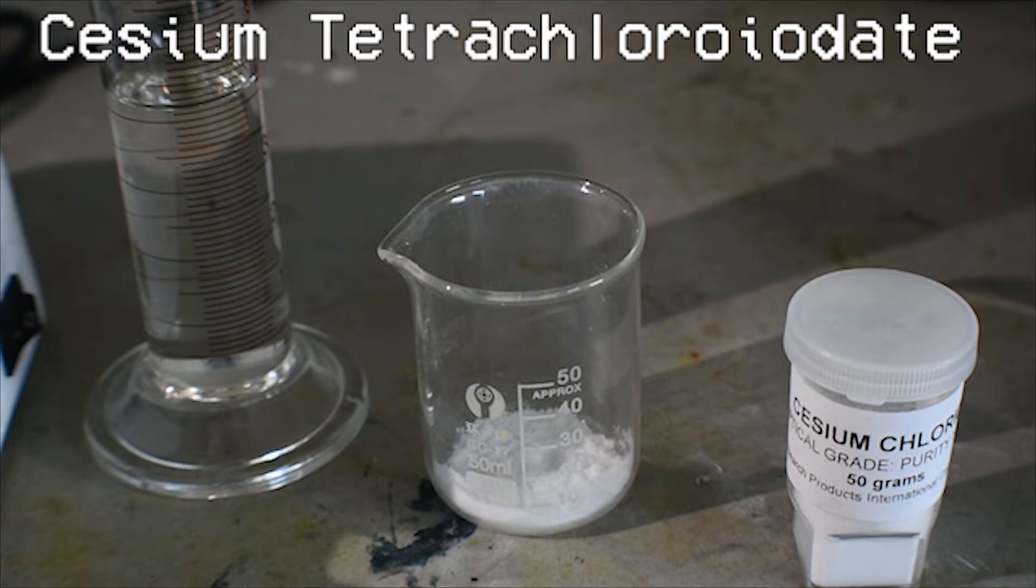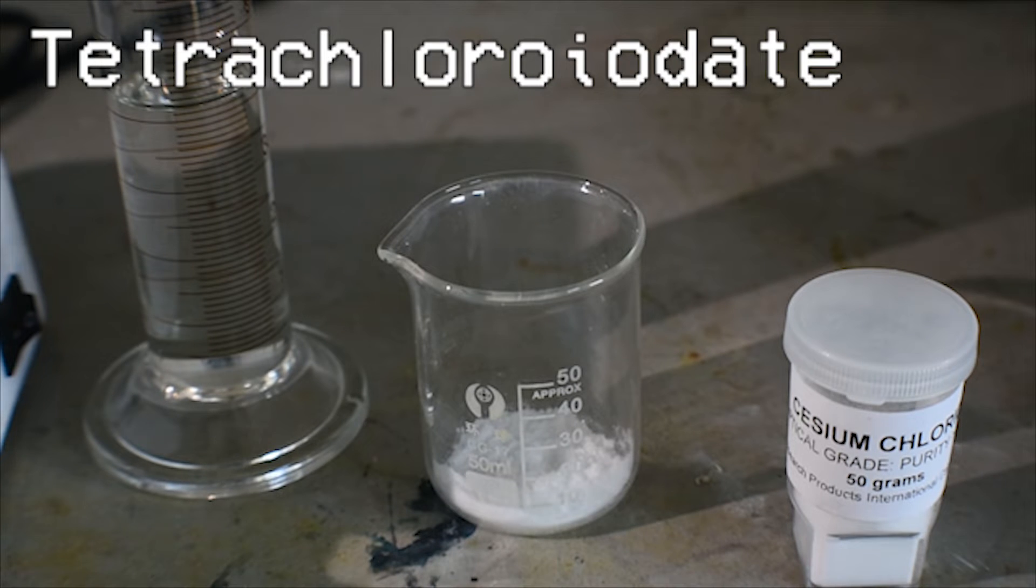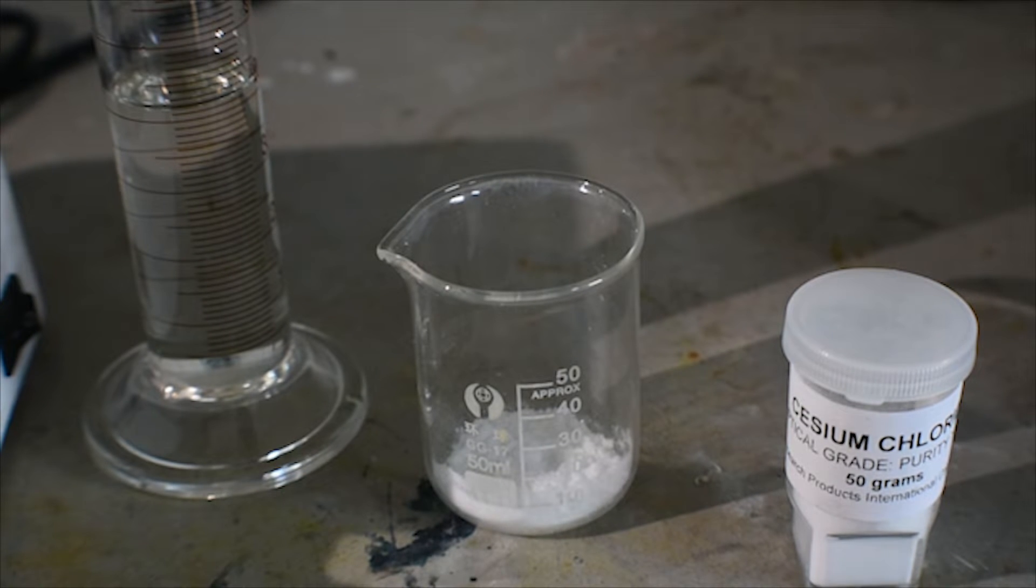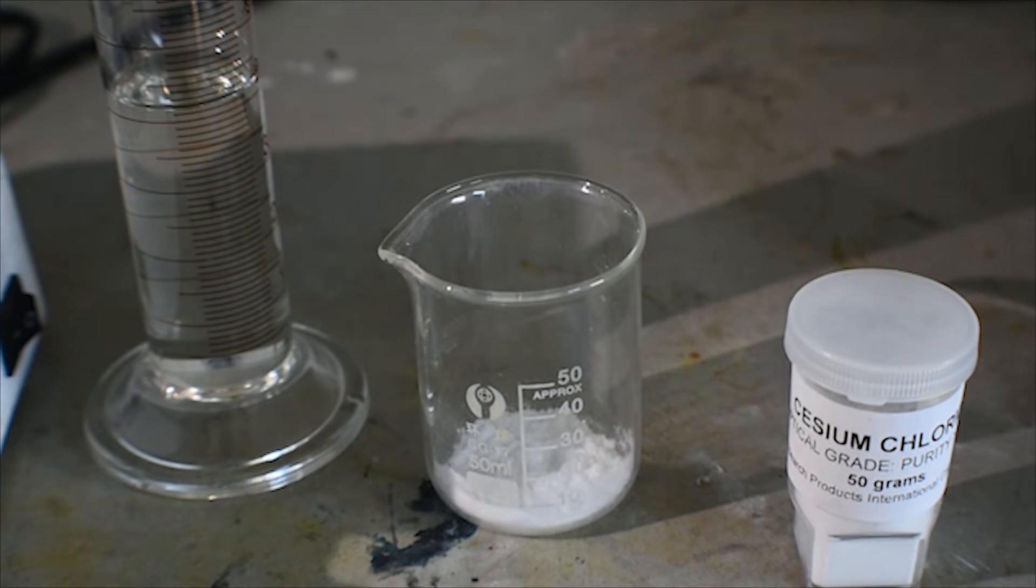This compound is pretty interesting because it contains the tetrachloroiodate ion with the formula ICL4-. This can combine with an ion such as potassium, sodium, rubidium, or cesium to create a salt.